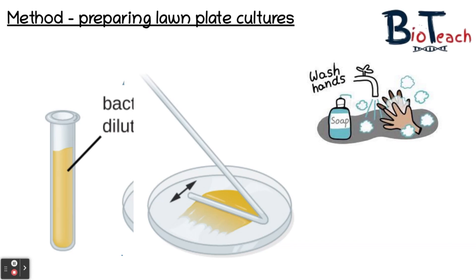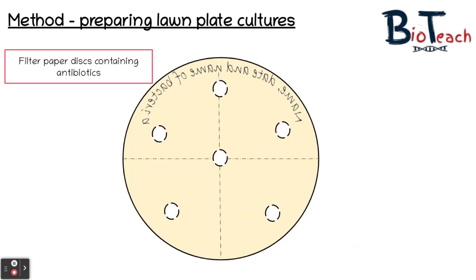Once you have spread it adequately, you will replace the lid of the petri dish and leave the lawn plate for around five to ten minutes — this allows the broth to be absorbed onto the surface of the nutrient agar. After the rest period, you will then place filter paper discs containing your antimicrobial substances on the plate. Use forceps to dip the filter paper discs into a test solution so the disc is wet, then shake off any excess moisture, and place them gently onto your lawn plate culture. You may also use a pipette to apply a smaller volume of solution onto the disc.